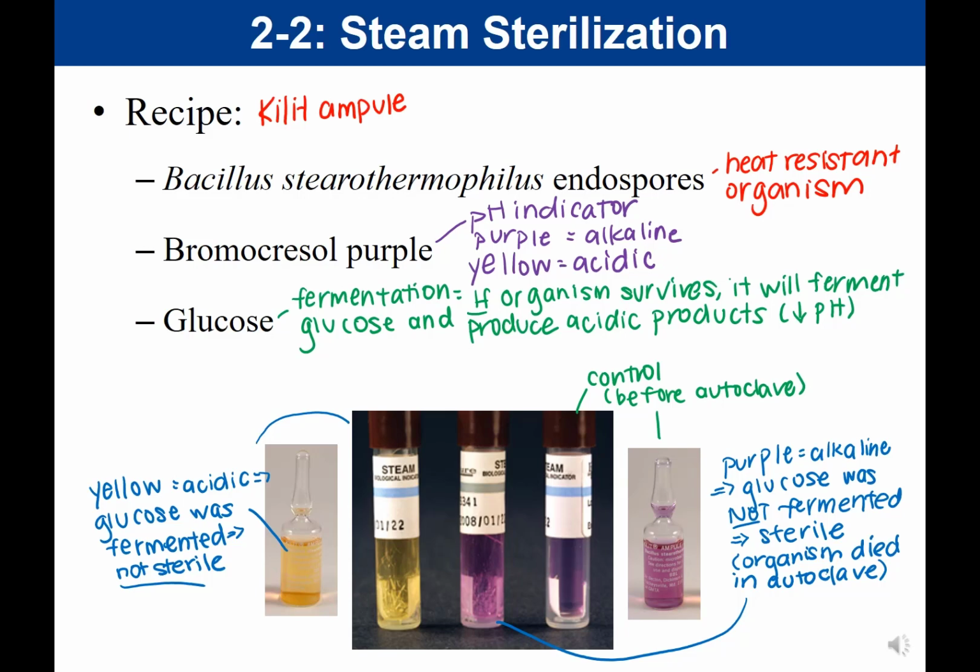And so that's our steam sterilization. So this is basically checking to see if the autoclave is working properly.